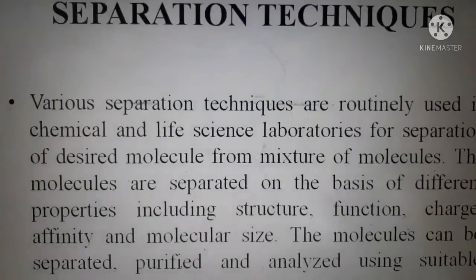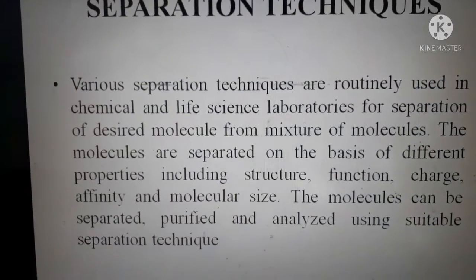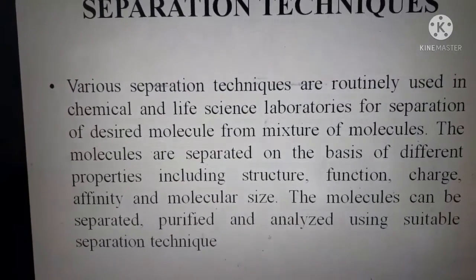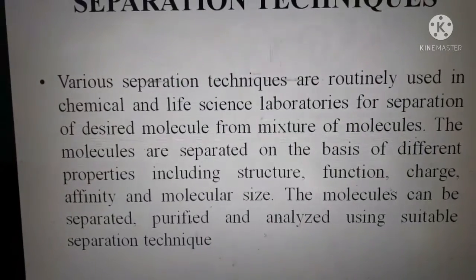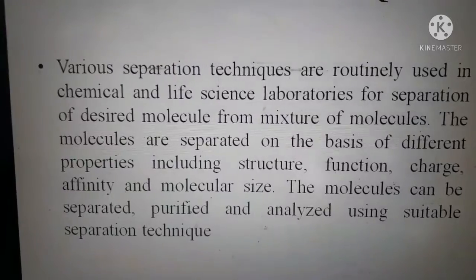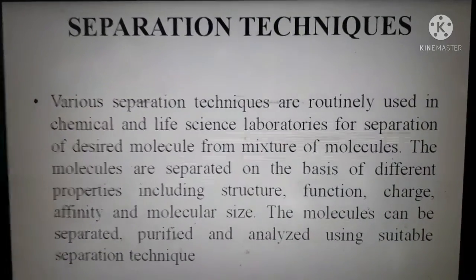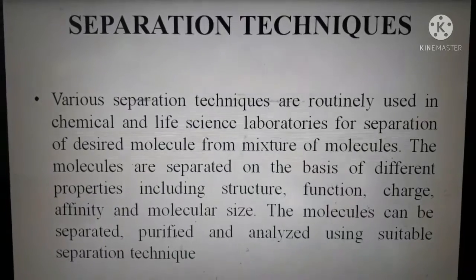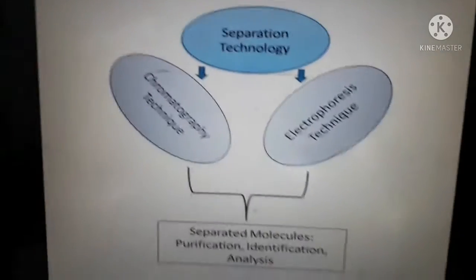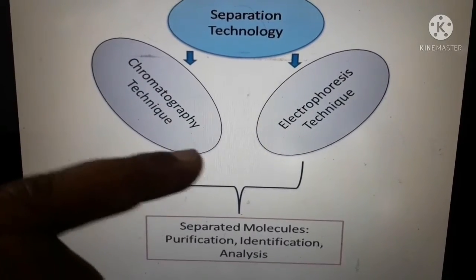Broadly, we use two separation techniques for the separation of molecules depending upon the desired properties, and these properties may be the structure, maybe the function, charge, affinity, their size. So depending upon the purpose, we use the separation techniques, and commonly there are two types of separation techniques. One is the chromatography technique, and the other is electrophoresis.